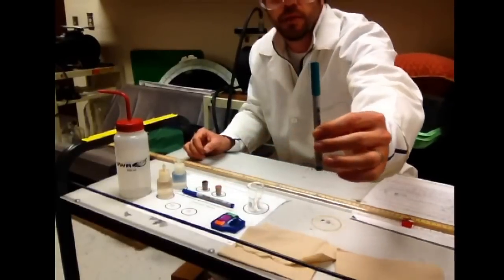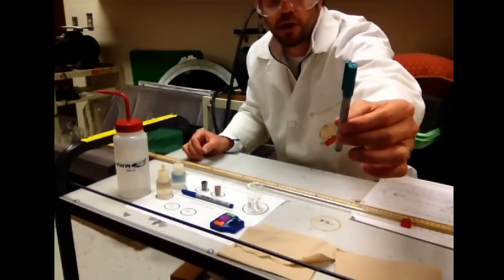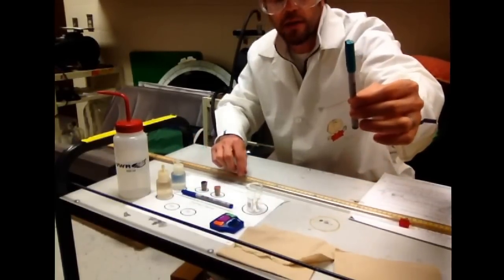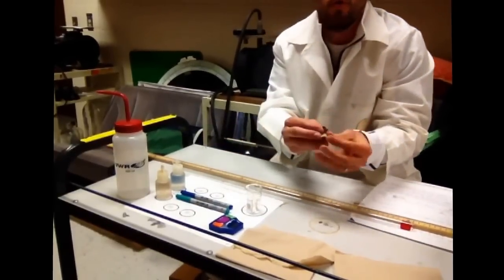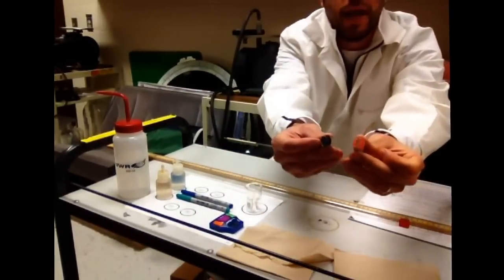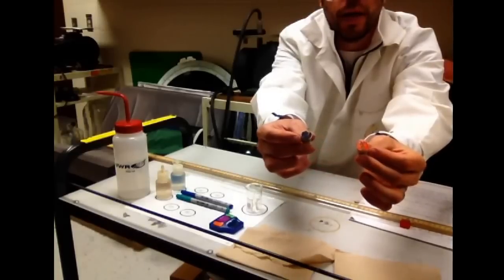We have some washable markers so you can write on the glass tube. We have a couple of corks, one is red and one is black so that you know which gas is which.